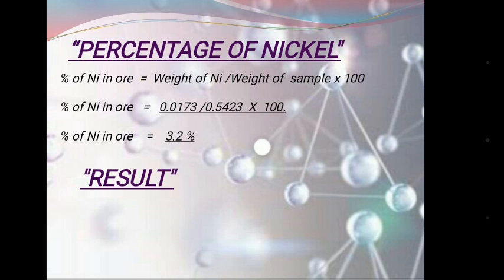At the end, the result of this analysis: the percentage of nickel(II) in the ore is found to be 3.2%.